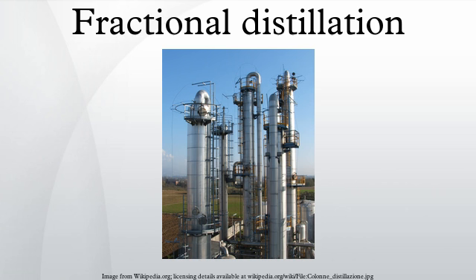As the mixed vapor ascends the temperature gradient, some of the vapor condenses and revaporizes along the temperature gradient. Each time the vapor condenses and vaporizes, the composition of the more volatile component in the vapor increases. This distills the vapor along the length of the column, and eventually the vapor is composed solely of the more volatile component. The vapor condenses on the glass platforms, known as trays, inside the column, and runs back down into the liquid below, refluxing distillate.